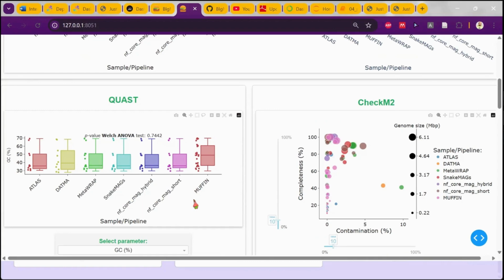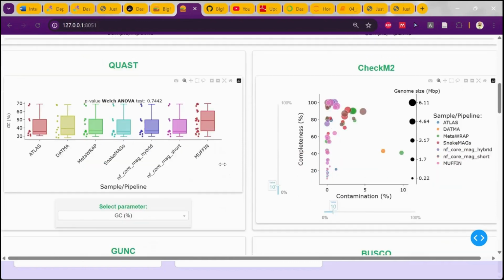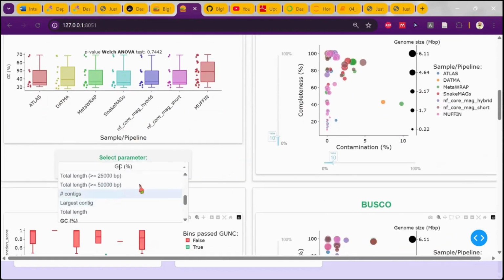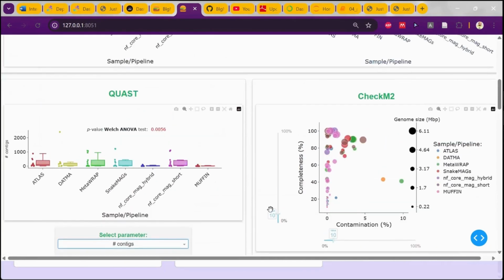But this one is created with the graph objects library, because I wanted this rainbow color, and basic Plotly Express wasn't able to assign these colors. It's filled with interactivity, with drop-down menus, as you can see here, that I can use to change what is being displayed.